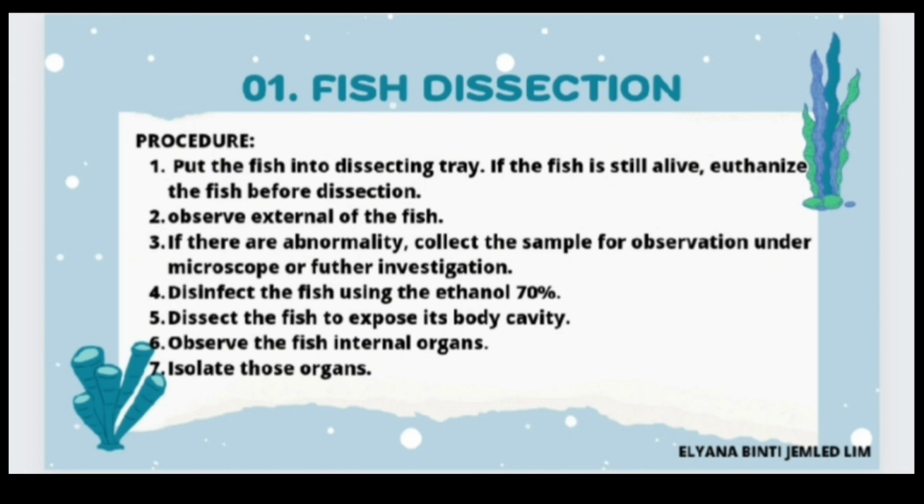Number 5 is dissect the fish to expose its body cavity. Number 6 is observe the fish internal organs. And the last one is isolate those organs.